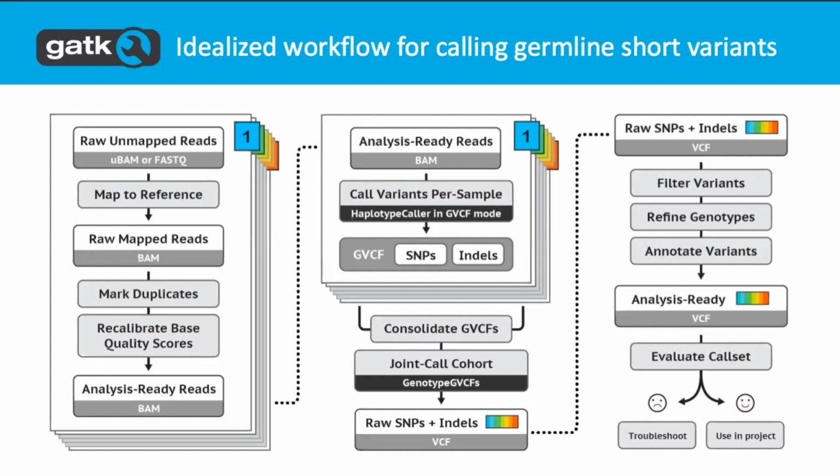In some cases, that means reprocessing and recalling some things that were done previously. But we want to do that to eliminate batch effects as much as possible. Even like the gnomAD call sets. So gnomAD stands for genome aggregation database, and at this point it combines data from 100,000 exomes, and I think we're at 70,000 whole genomes within the latest version that has been called.